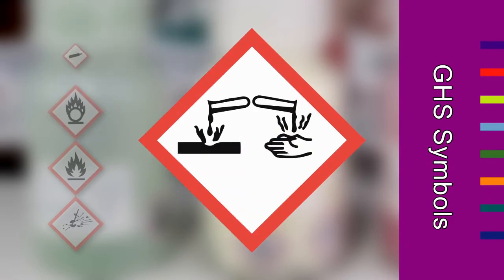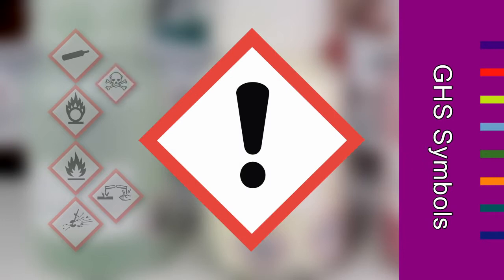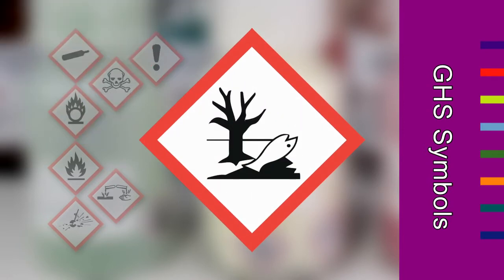The corrosion symbol signifies compounds which are corrosive to the skin, may cause severe eye damage, or are corrosive with respect to metals. And the skull with the crossbones warns of chemicals which are acutely toxic within categories 1 to 3. The exclamation mark signifies chemicals with acute toxicity of category 4 and skin-irritating chemicals of category 2. The upper body with a star represents danger for your health, and the label is used for carcinogenic chemicals category 1A, 1B, 2, and also warns of the danger of aspiration, sensitization of the respiratory tract, and target organ toxicity. Lastly, the dead fish is used to label chemicals which may harm the general environment, or more specifically, the water environment.